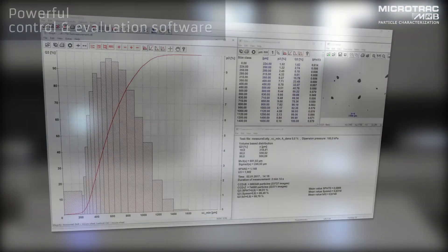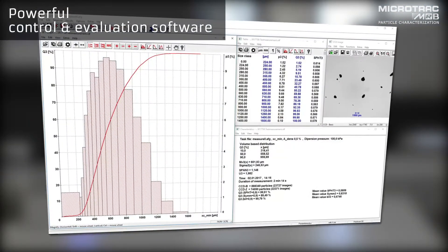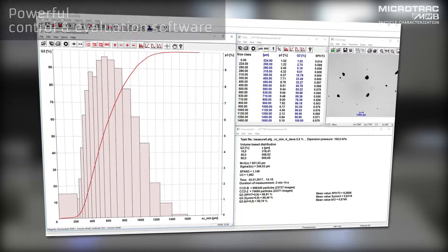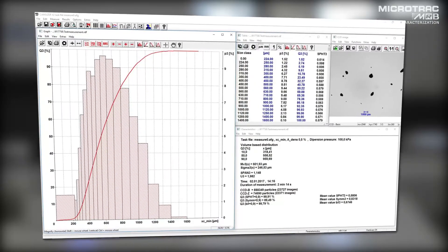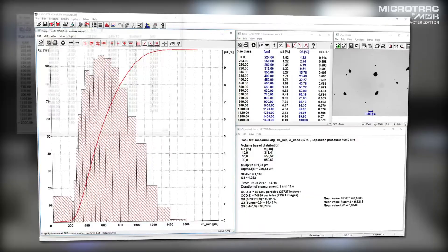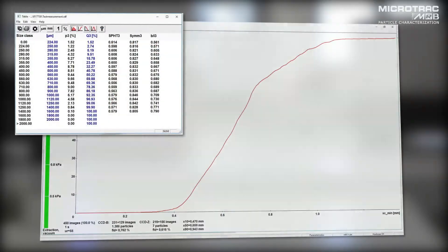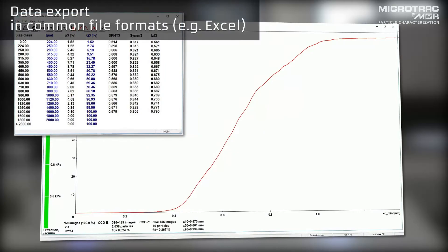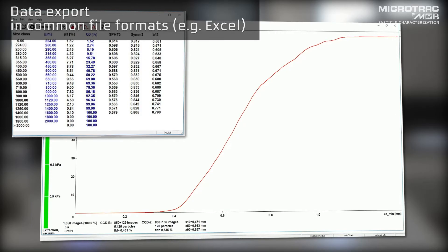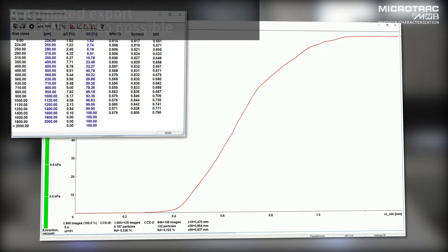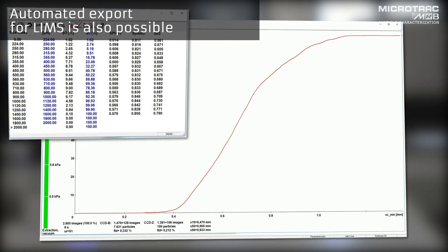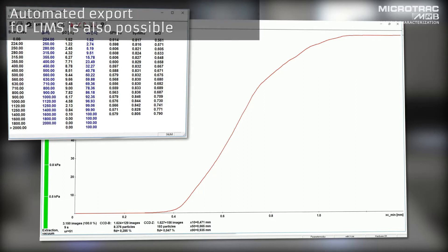Retsch Technology supplies the CamSizer X2 complete with an elaborate and powerful control and evaluation software. Measurement data are displayed in tables or charts and can be exported in common file formats like Microsoft Excel. Automated data export for laboratory information management systems is also possible.